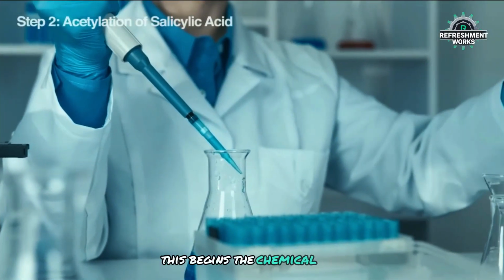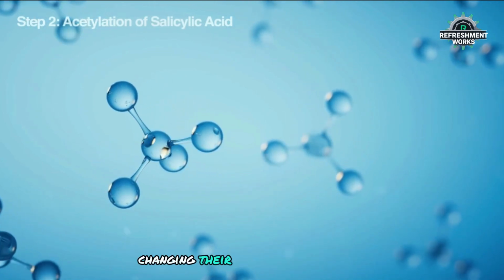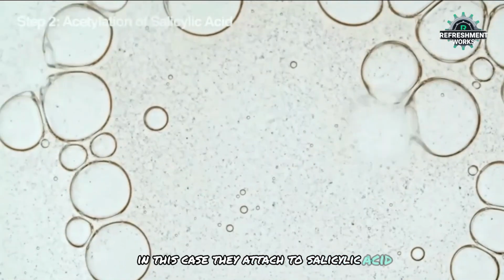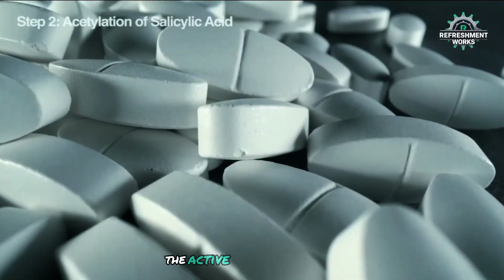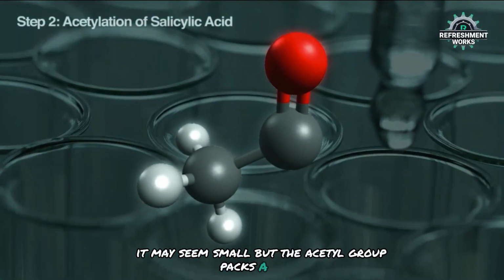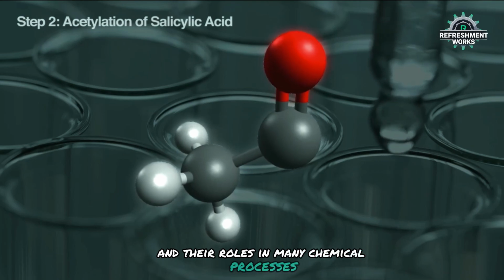This begins the chemical process. Acetyl groups can attach to other molecules, changing their properties and functions. In this case, they attach to salicylic acid. This transforms it into acetyl salicylic acid, the active ingredient in aspirin. It may seem small, but the acetyl group packs a punch. It shapes molecules and their roles in many chemical processes.